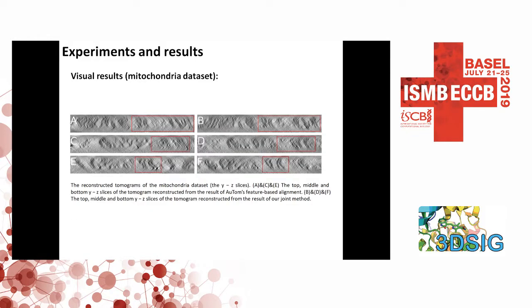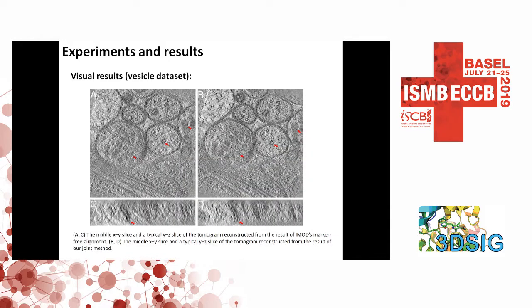Here are other examples. Here we also test the solutions on the vesicle data set and compared it with the classic feature-based method, the classic method in IMOD.